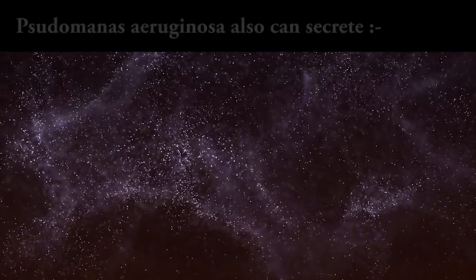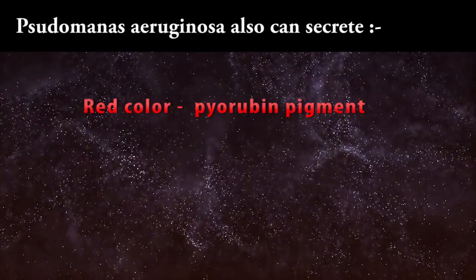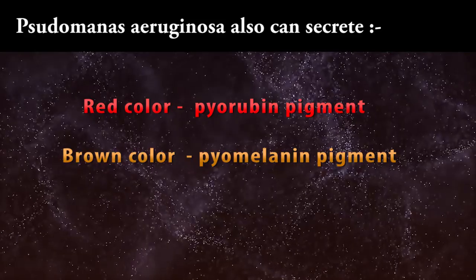But remember, Pseudomonas aeruginosa can also secrete red color pyorubin pigment and brown color pyomelanin.